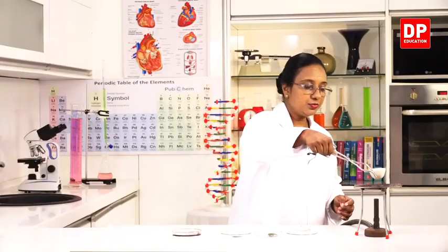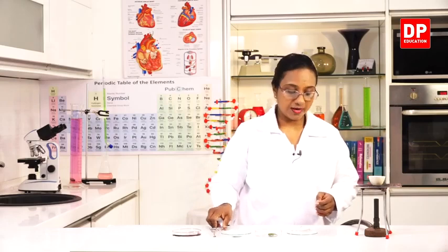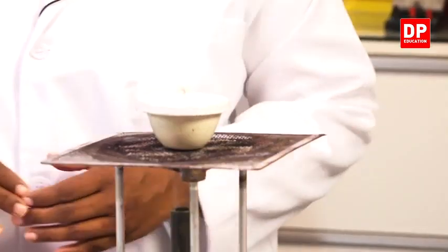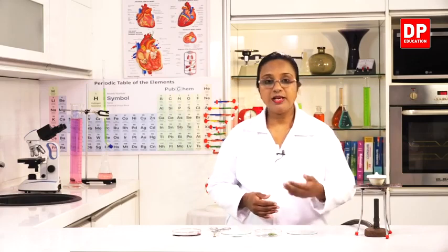Then we place it on the tripod on top of the wire mesh, and I will close it with the lid. After it gets heated up for some time, we will remove the lid and cover it with the watch glass so that the vapor that is coming out will condense on this watch glass.